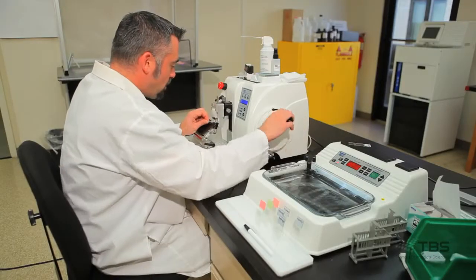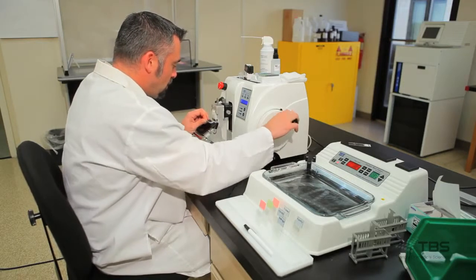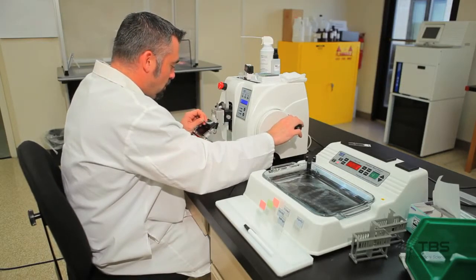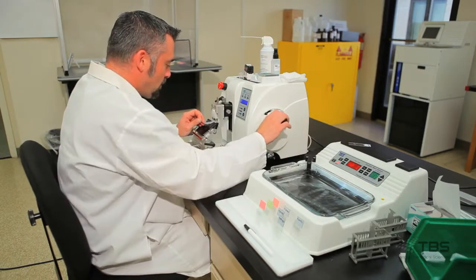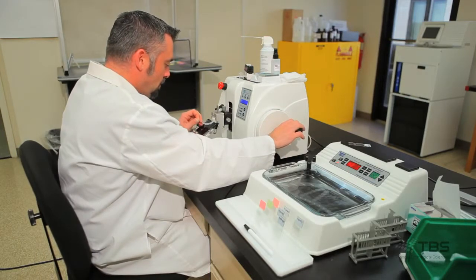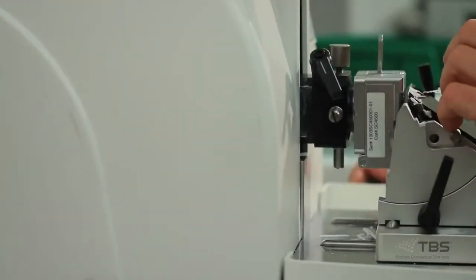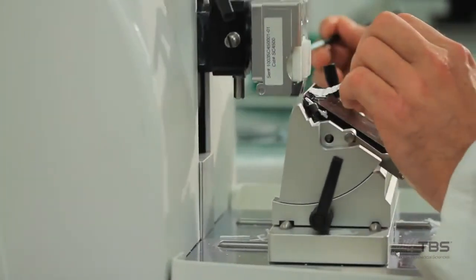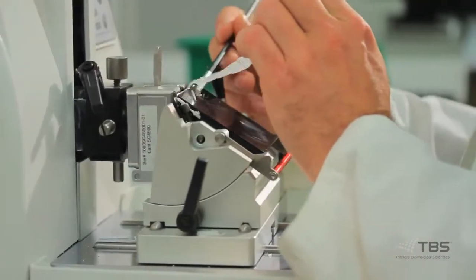TBS's fully automated SC4500 Microtome is ergonomically designed to reduce work-related musculoskeletal issues and keep the user safe. The 4500 has an adjustable speed motorized cutting stroke that can be customized to simulate a manual motion.